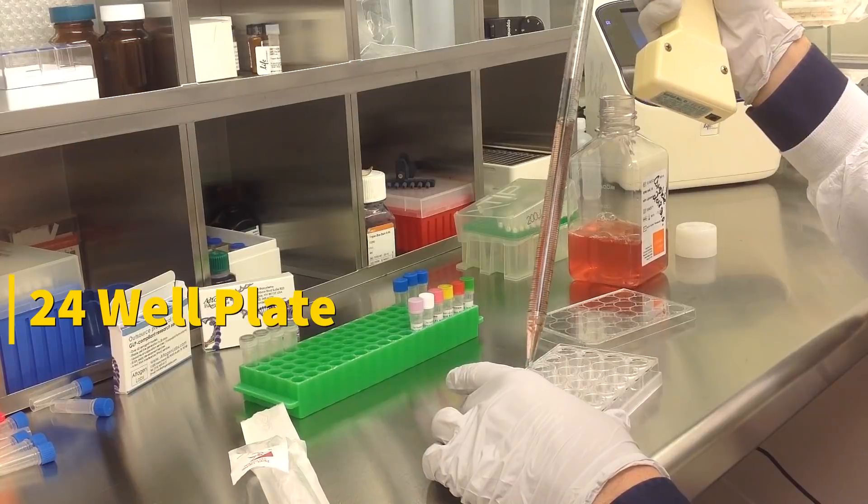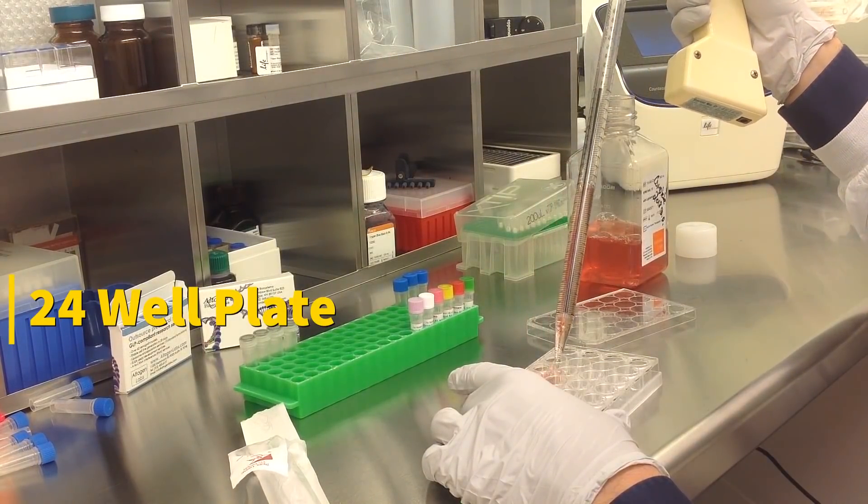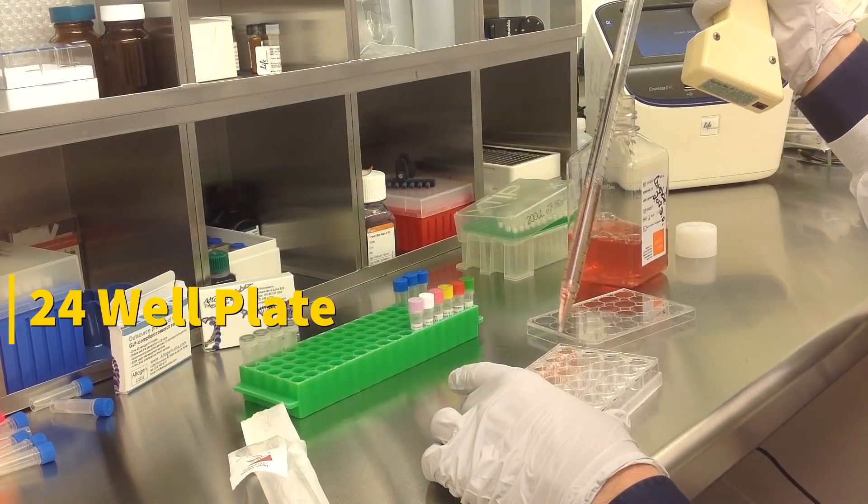Transfections can be scaled up or down based on plate surface area as described in the corresponding transfection protocol, which can be found at altagen.com.